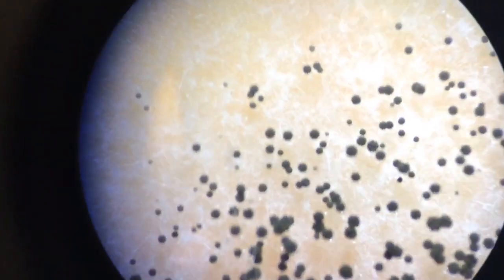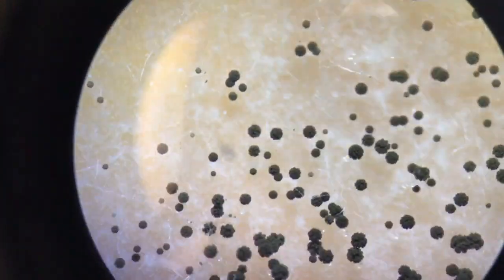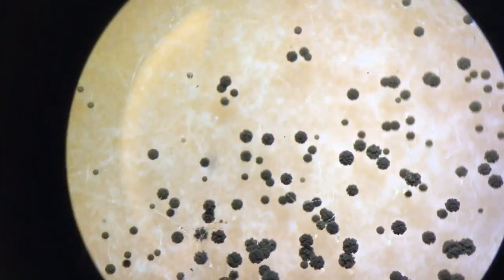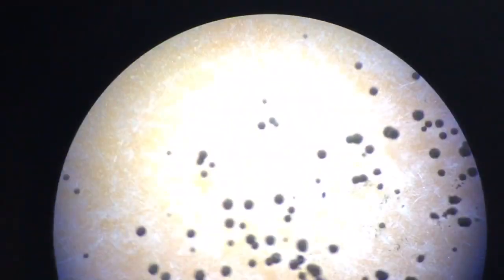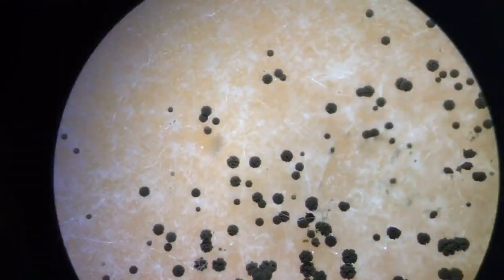As we can see here, the conidiophores have an irregular margin around them and they are dry. This is because Aspergillus produces spores out of the conidiophore that are not bound by a membrane, unlike Rhizopus.